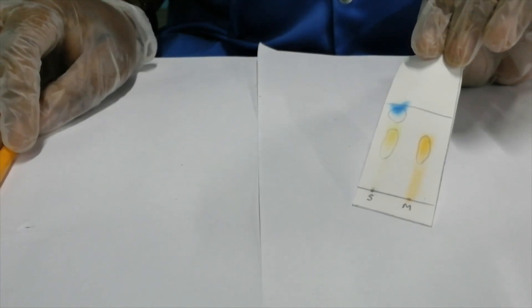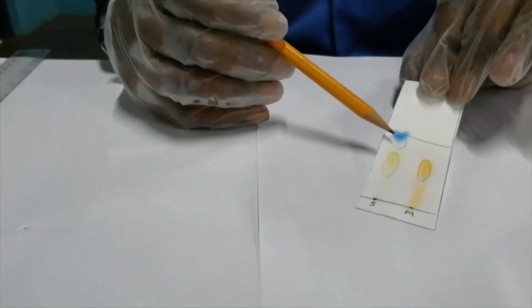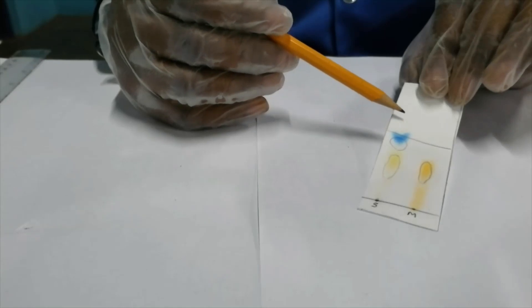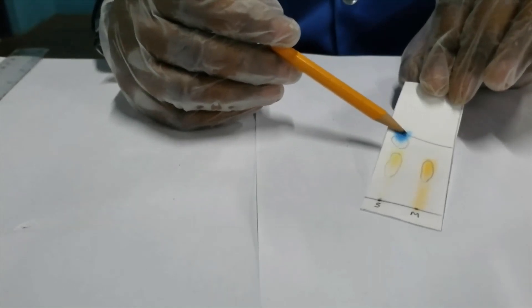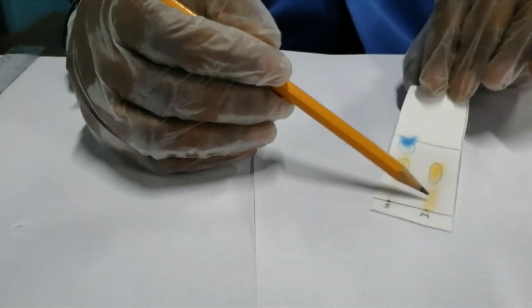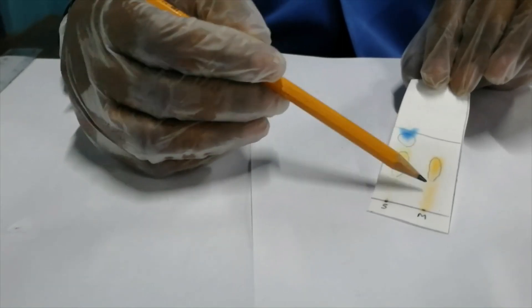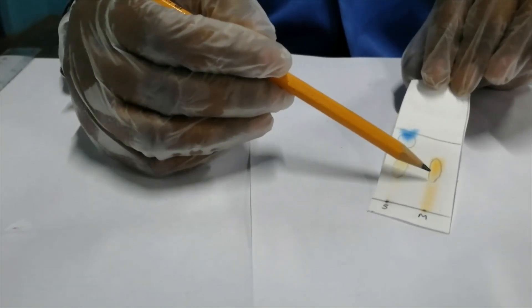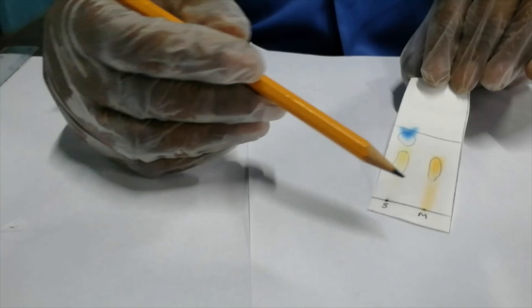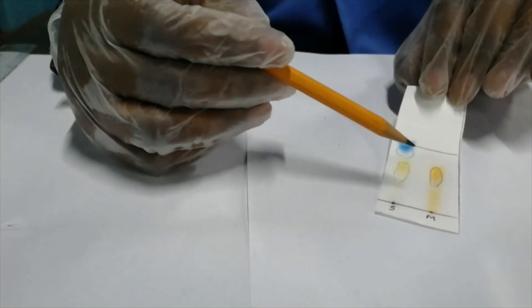Looking at the developed chromatogram, you can see why it was important to mark the solvent front and circle the spots. Because the paper was wet, the different particles still traveled along with the mobile phase, which is why we have the blue above where the line is now. With the methyl orange we have streaking, and the streaks are a result of different particles migrating at different rates along the mobile phase.